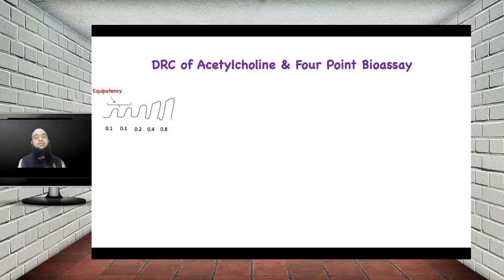Now you can see in this experiment, since we have to take many readings already, we are not going up to the submax and we are not going until we get the ceiling effect.